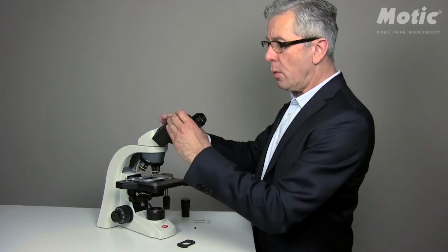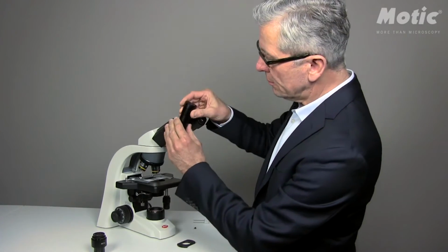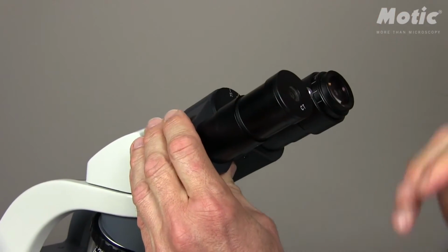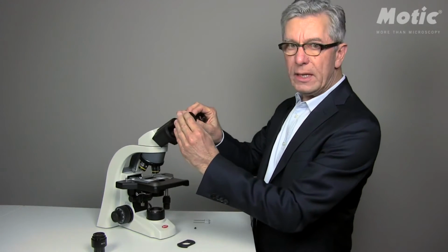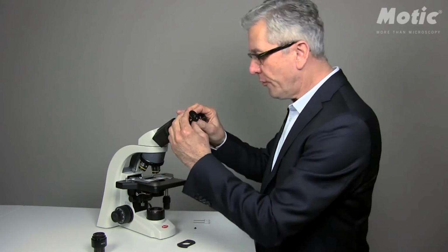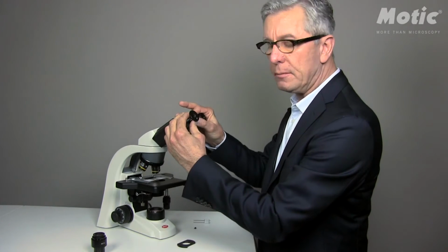Pull out one of the standard eyepieces and push in instead the centering telescope. The centering telescope will help you to find the back focal plane of the objective, where you can find an image of the illumination and the dark ring inside the objective. Loosen the screw, pull out the inner part of the centering telescope and try to focus on this back focal plane. Once you found it, please fix the inner part again.